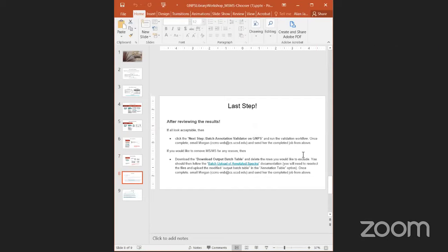Alan, it's not only just mistakes, it's also when you have partial information. It's better to have that information in there and then update it in the future, and that's what we're seeing often. Let's say in molecular networking, you find a spectrum is related to an annotation by 16 Dalton, or 15.995, which is an oxygen. You can say that it's the oxygenated species of that. But then later on, when you establish the exact structure, you can upload the InChI or SMILES.